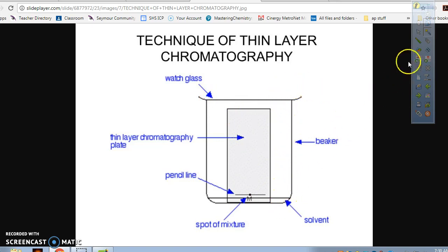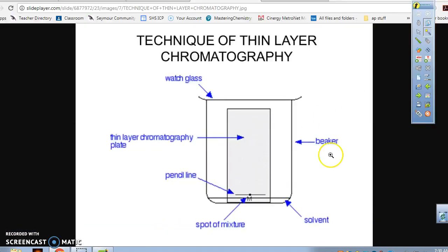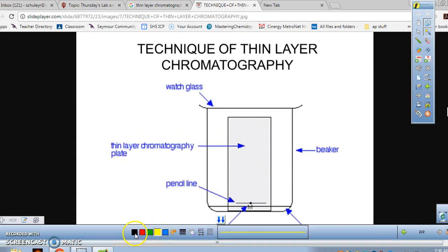And if I could draw that wick in very simply, you're just going to take a piece of filter paper, cut it into a strip, and when you cut it into a strip, what you can do with it is, I'll just show that in here, hanging in here, and you hang it over the side of the container.